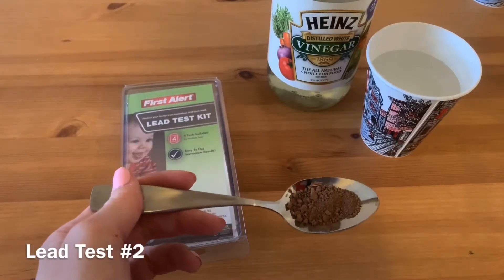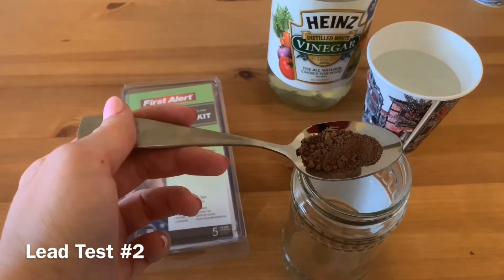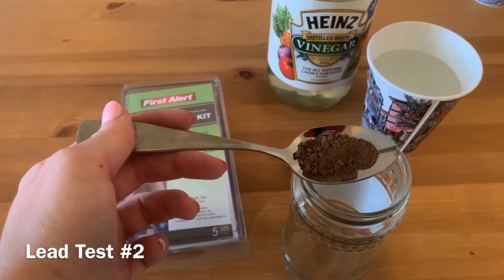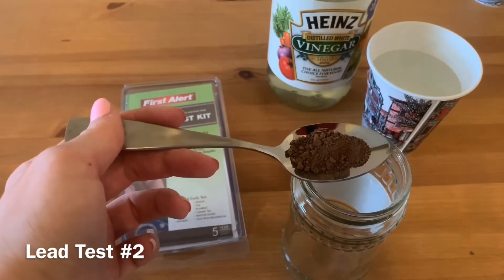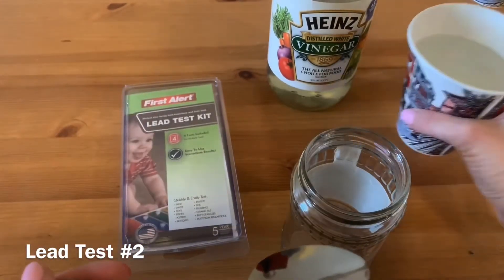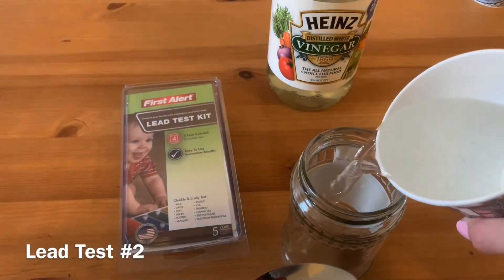Add a representative sample of dry soil from the area you wish to test. Transfer half of the spoon of soil into a glass measuring cup or lead-free container like plastic or glass, and then add 250 ml or 1 cup of white vinegar.